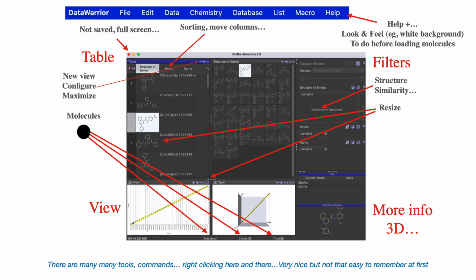You can resize windows, open sub-windows, and customize the layout to suit your workflow. Because of this richness, getting comfortable with the interface may take a bit of time and exploration. Don't worry if it feels overwhelming at first. This is normal, and you'll get more efficient as you continue using it.